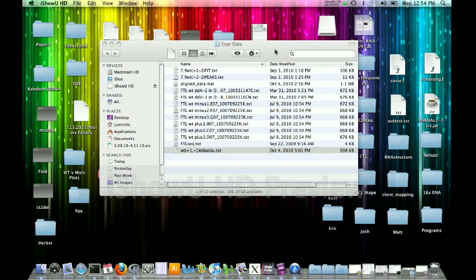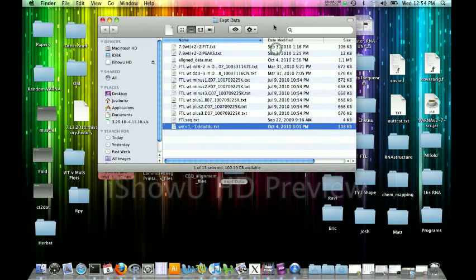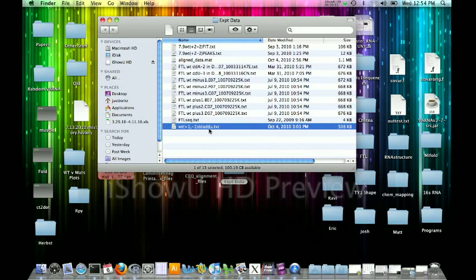First, you must locate the data that you have already aligned and assembled. Here we have our wild type plus one, minus one, DDA, DDU assembled file. In this we have our plus reagent, our minus reagent, our DDA ladder, and our DDU ladder all assembled into four filters.